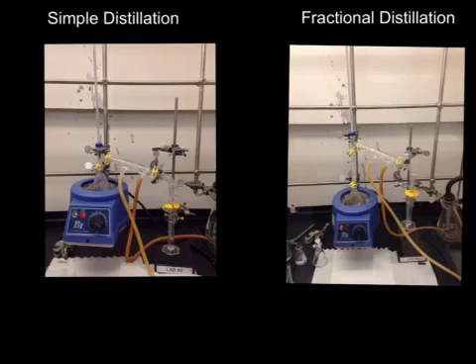When the two liquids are mixed together, the liquid that is more volatile will typically have a higher vapor pressure. Once the vapor condenses, it turns back into a liquid and it is collected every 0.5 milliliters until a total of 15 milliliters for the comparison of simple and fractional distillation.